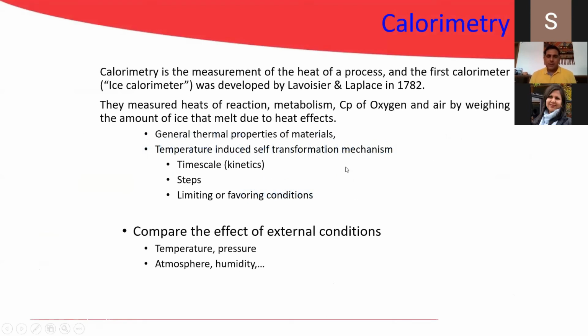So the first part is the calorimetry part. Calorimetry is a measure of the change of heat process with respect to sample temperature, so that you can measure with respect to time and temperature both, and then see how your sample is behaving whenever there is a temperature change, right? The temperature change could be by atmosphere, or we can change it from our side manually, a man-made change.